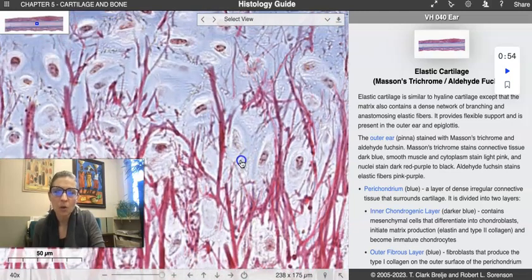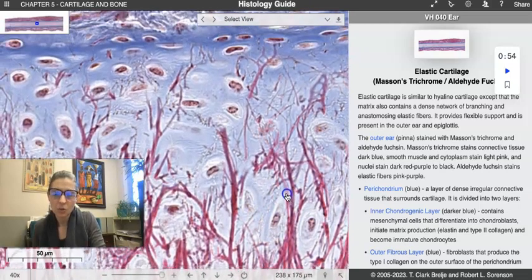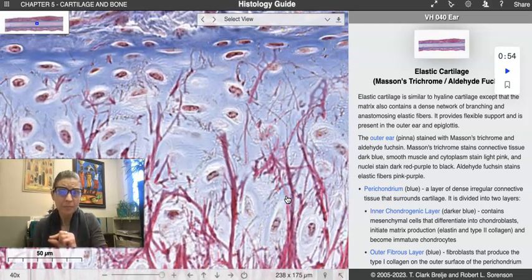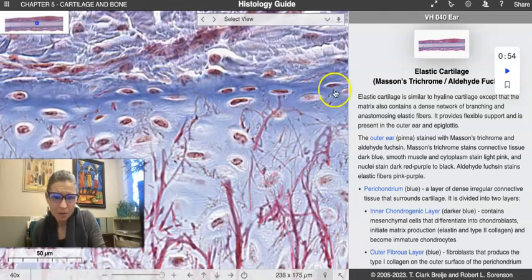So even if we were to go to either side of this hunk of cartilage, we're going to start to run into the periphery. And even here, you can see that we have cartilaginous cells. We have essentially mesenchymal cells that start to differentiate here to make the surface of the cartilage, and also to start making the membrane or the perichondrium. So even as we're all the way out here, these are still chondrocytes. You can see that there are still lacunae around them.